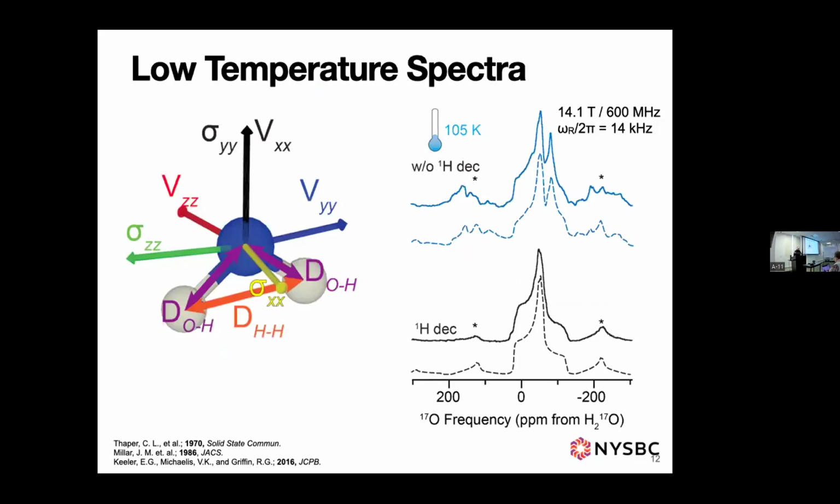So I mentioned that we turned on proton decoupling. So what happens if we don't proton decouple when we're really cold? Well, this is what happens. We get this spectrum right here.